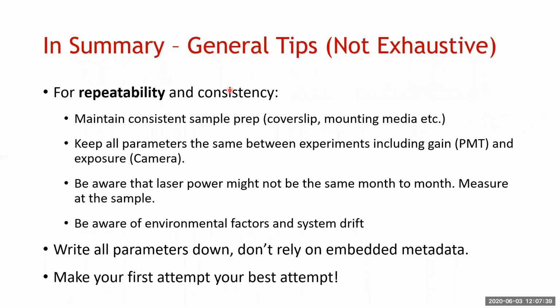Lastly, with repeatability, you want to maintain consistent sample prep. So you want to make sure, obviously, to use the same mounting media and the same thickness of cover slip every time if you're going to be using the same experiment. Because if you start to mix and match, you're going to get very bad results. Keep all parameters the same.